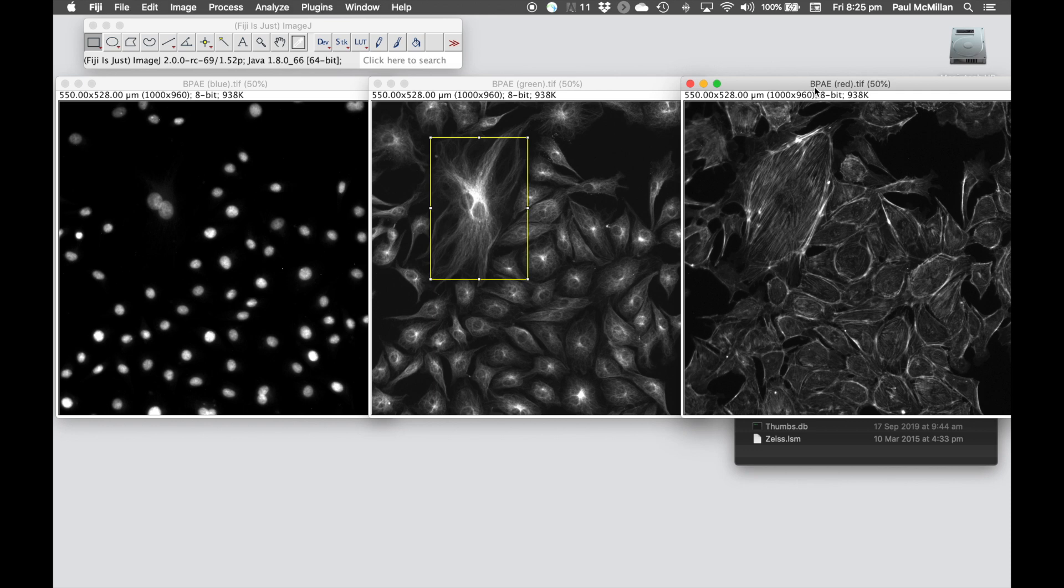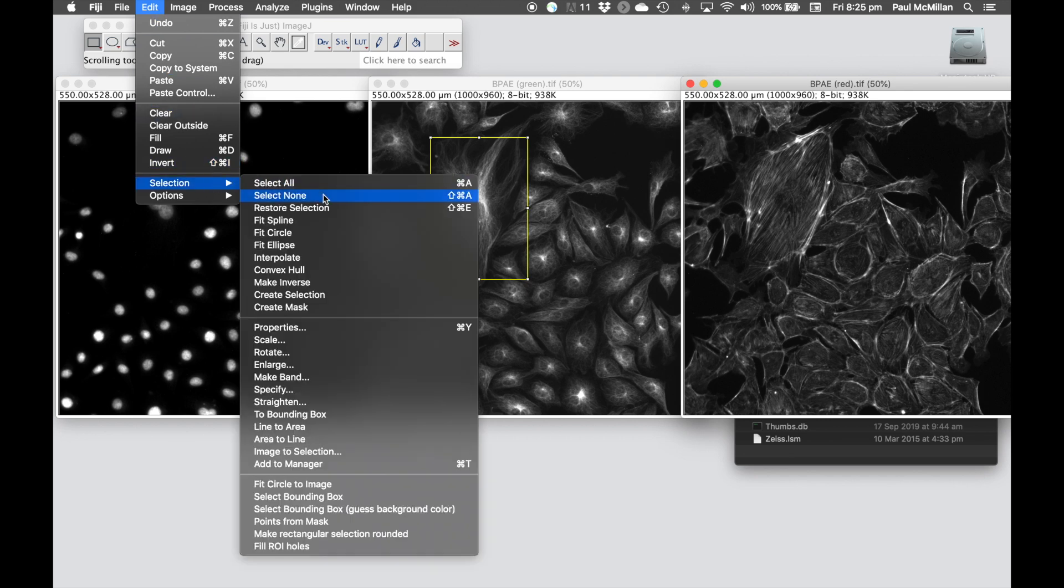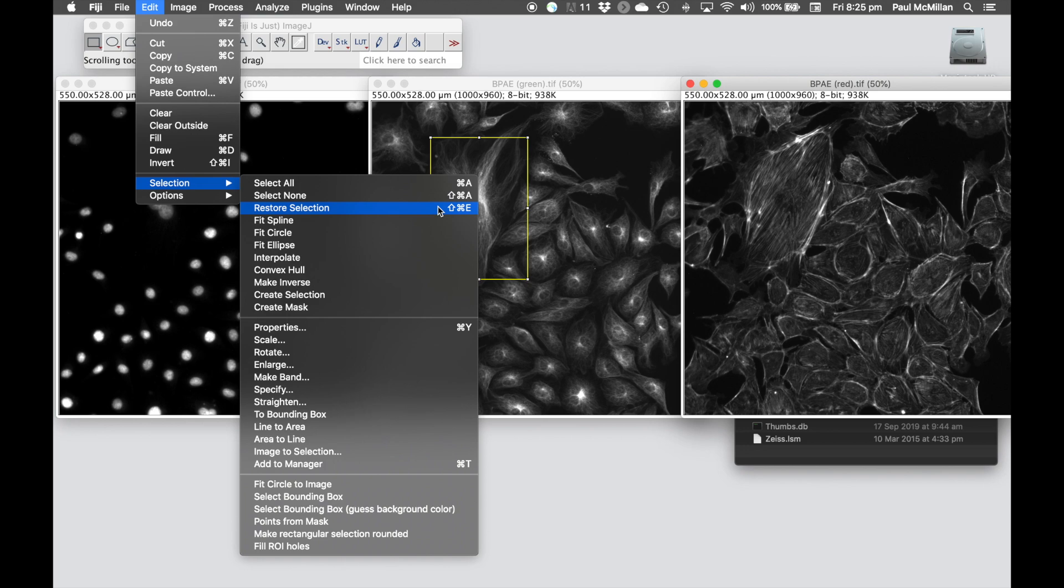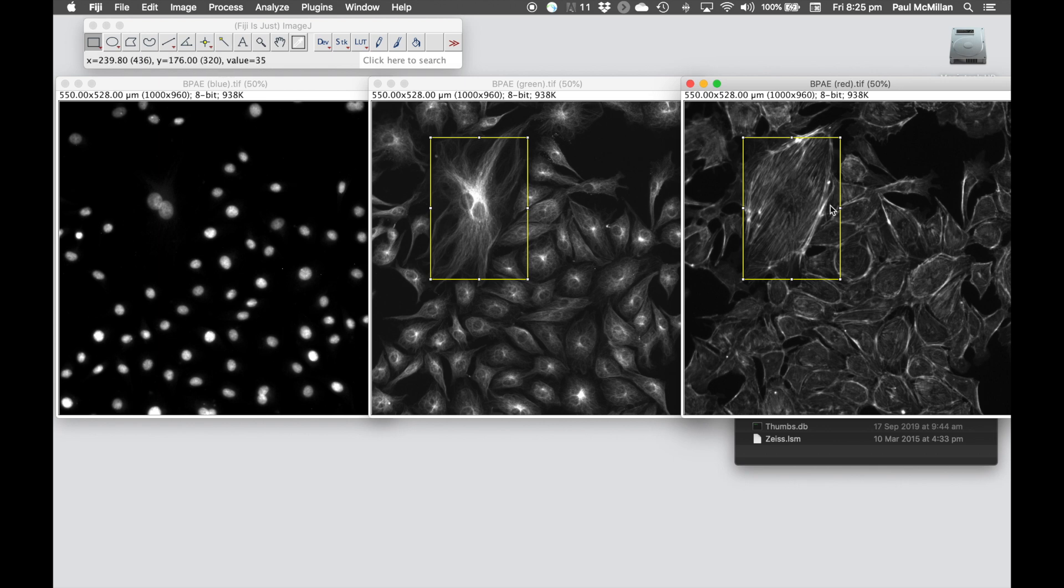Next thing we're going to do is go into Fiji, Edit, Selection, and hit Restore Selection. Now, the shortcut for that is Control-Shift-E or Command-Shift-E if you're on a Mac. So now we've got the red channel selected. If I click this, that's then going to restore that region of interest onto that red channel.